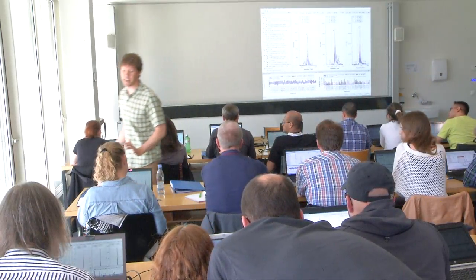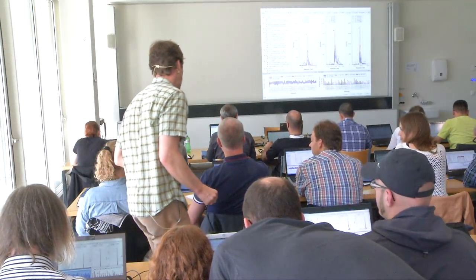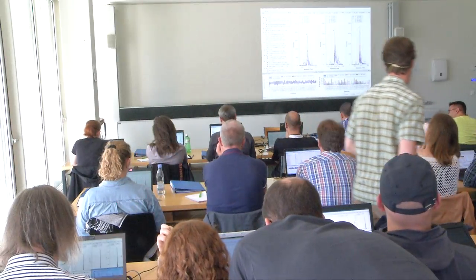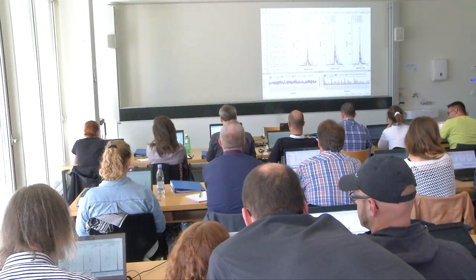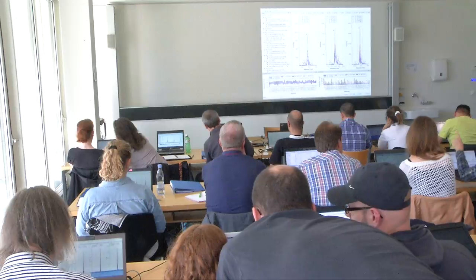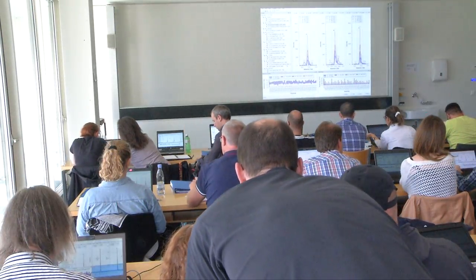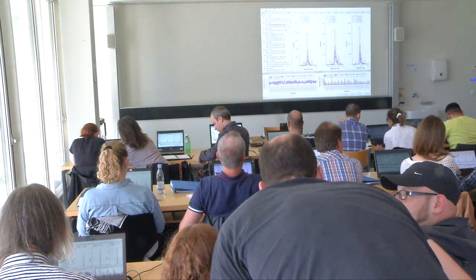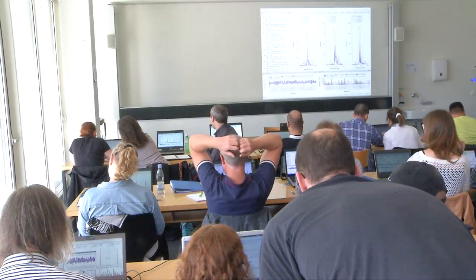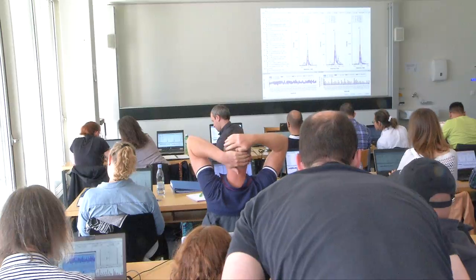Anybody else? Raise your hand if you don't think you quite have this view. So we'll talk about that all together. Okay. So here you're in the peptide comparison graph, and you want to be in the replicate comparison graph. Good job, everyone. It's looking pretty good.